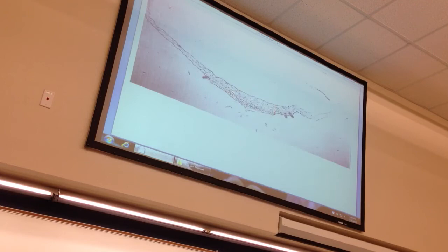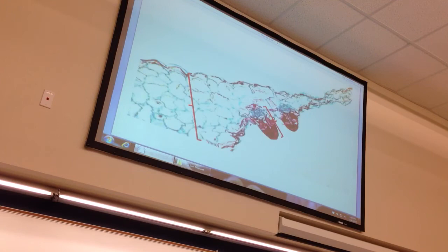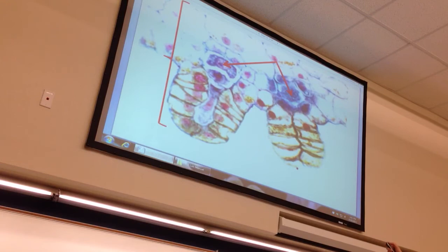Then if you took a longitudinal section through the part where the notch was, notice it's thicker. The prothallus is thicker. And then that's the archegonium. And this whole structure here would be, what is this whole structure? If it's not an antheridia, what is it? Archegonium. This whole thing is a prothallus. And then here it is, bigger than life. This would be archegonium and this is the egg. So that one egg in each. Both archegonia have eggs in it, correct. What's the red stuff? The red stuff would be nuclei, the nuclei of the cells.